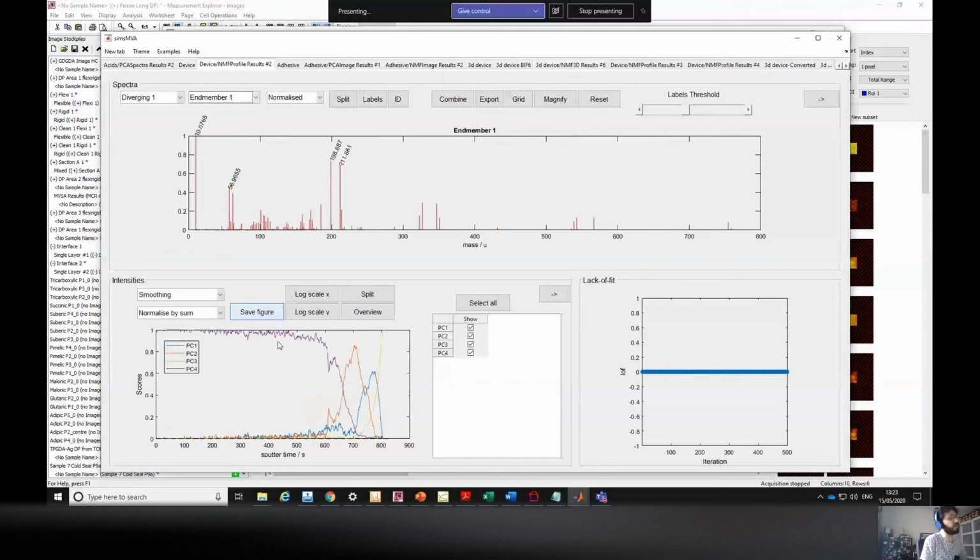Look at this depth profile with a thick layer on top and then 2 thin layers and a substrate. So now let's use the exact same data set, but instead of exporting the data as 1D or only depth profiling data, let's explore all the voxels so that we have a 3D data set.